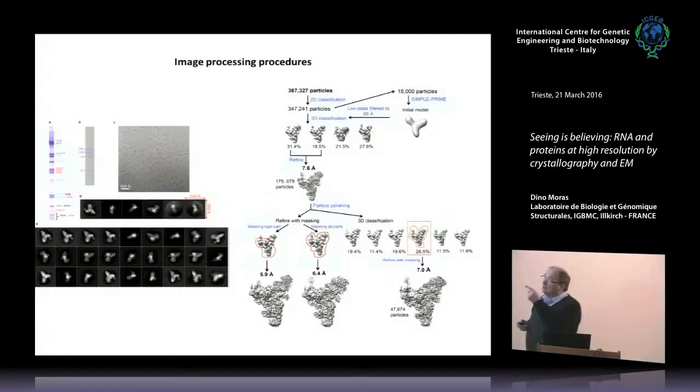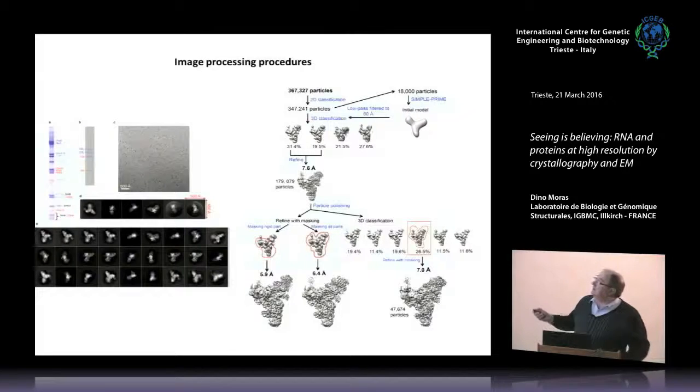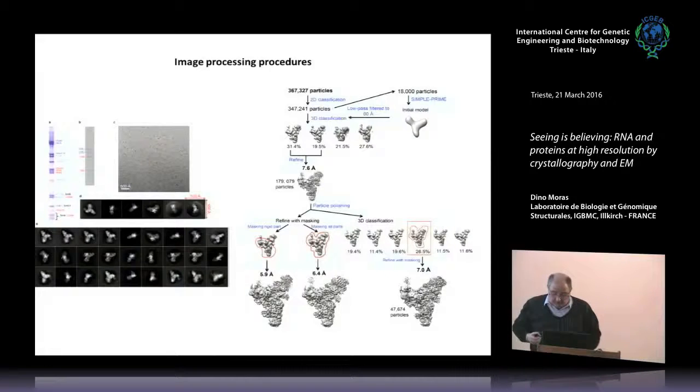No. Of course, I was saying there may be a different object that is complexed with one more protein or another, or there can be different conformers. That is the dynamics. So when you froze that, you have one conformation and another. These are two objects. And at that time, when you reconstruct, you see this, we'll come back to that. I think weaker, that's right.